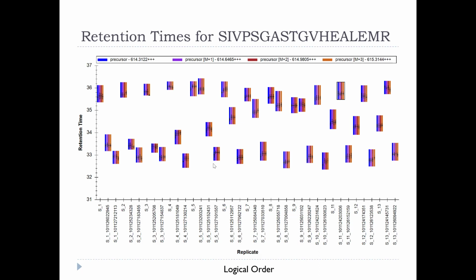So do we think maybe it's just picking between two things, and it's randomly jumping, sometimes choosing one or choosing another? Anybody have any other ideas? A PTM, yeah, so maybe it's a PTM, and it's what Brian showed us, and this is one phosphorylated type, and this is another phosphorylated type, right?